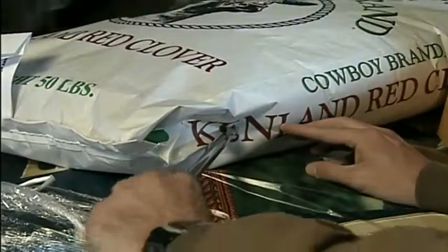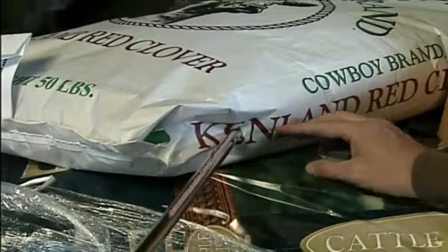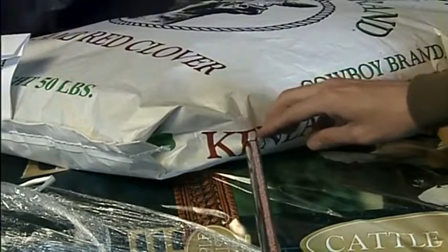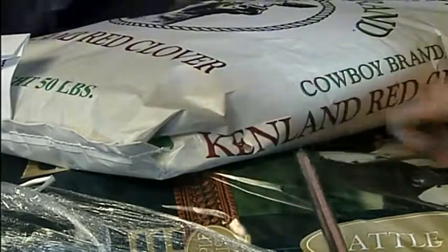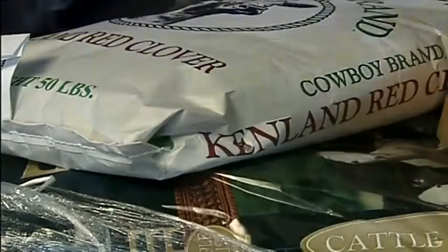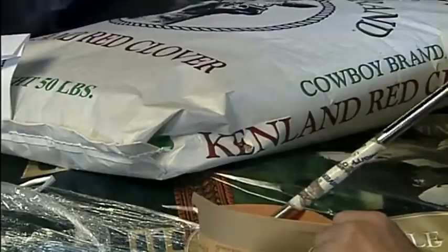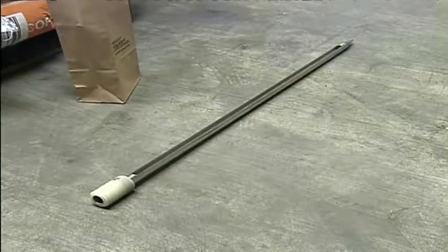For example, this is a carryover lot of red clover with 3 bags left. The amount of seed obtained from each bag should be equal to not bias the sample. In order to obtain the minimum of 5 triers and obtain an equal amount from each bag, you would sample each bag twice. When sampling the same bag more than once, be sure to follow a different path through the bag.